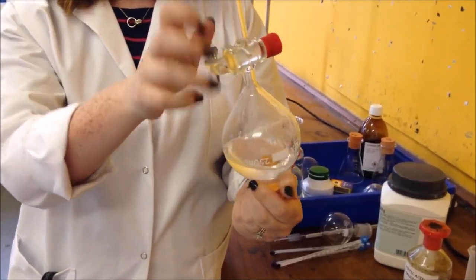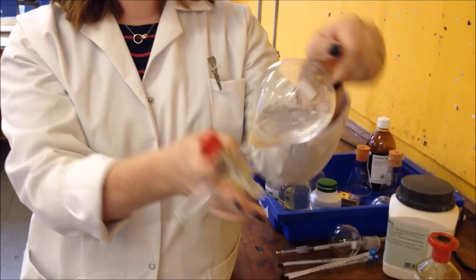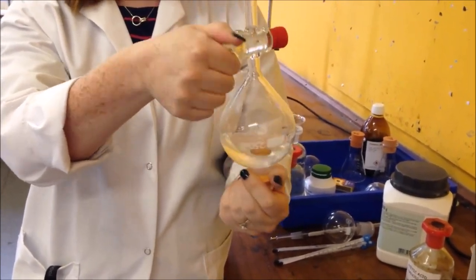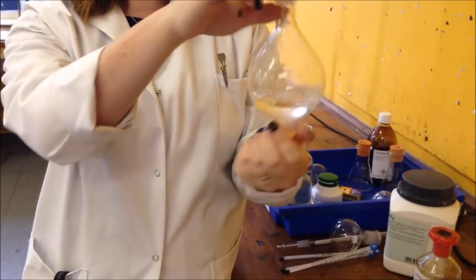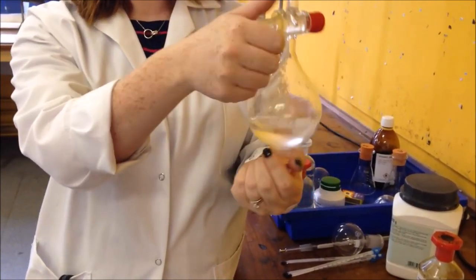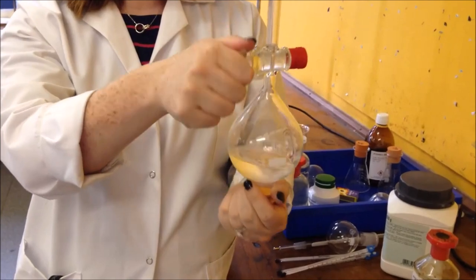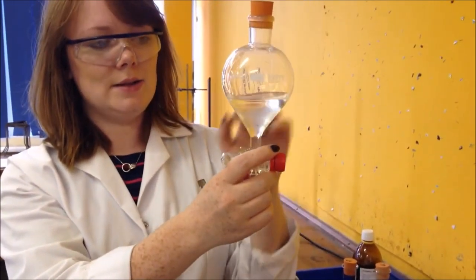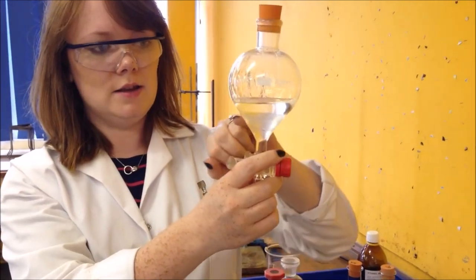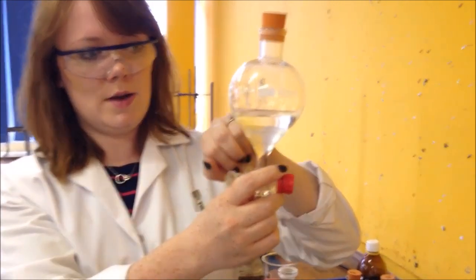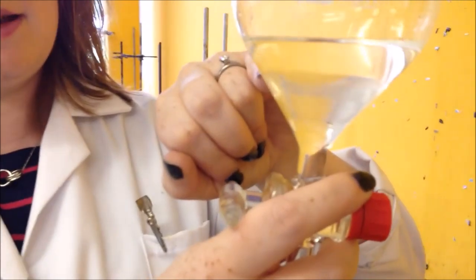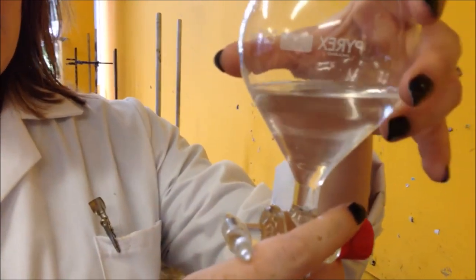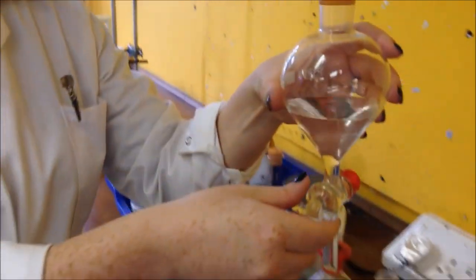Invert it until you stop hearing that fizz that it'll release—that tells you a gas has been produced. And then turn it back up the right way and allow it to separate out into two different layers. You can already see here that we've got a lower layer and top layer separating out. I'm just going to leave that for a bit and then I'm going to take it over here and pull off the lower layer.